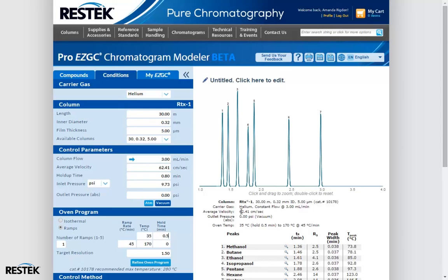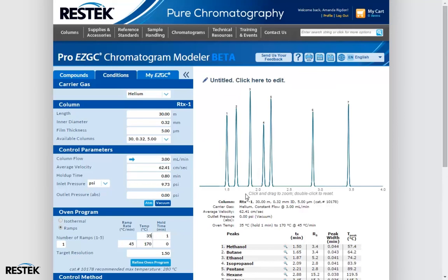What we have is a very good prediction of what our final chromatogram will look like. One thing to note is that this modeler does assume ideal injection conditions. For compounds like these, if we're using headspace, depending on our injection conditions, these two peaks may be a little bit wider. If we want to put a little bit more space between our peaks, we can just change our oven program accordingly. So if you're using splitless or headspace injection, the peaks at the beginning of your run may be a little wider than what the model predicts. As long as we know that, we can put more space in ourselves if we'd like.